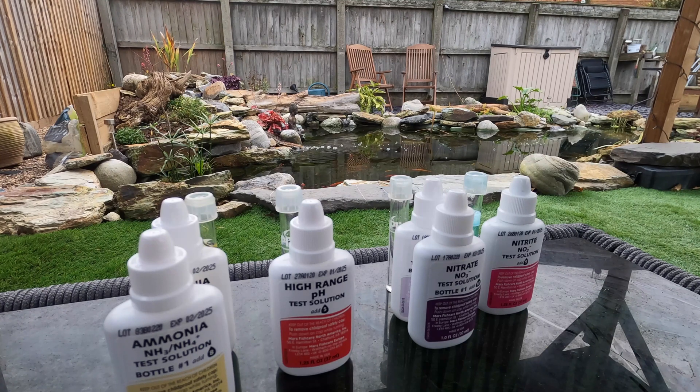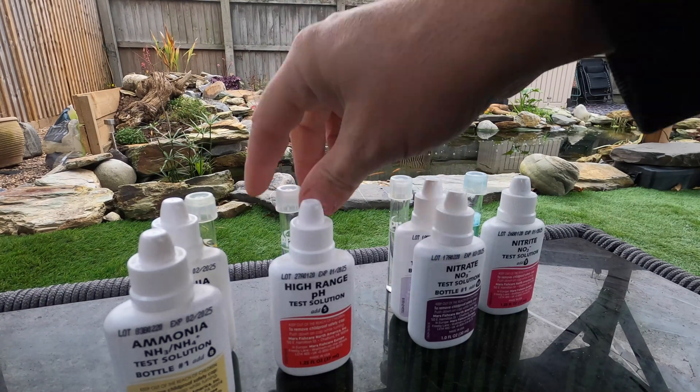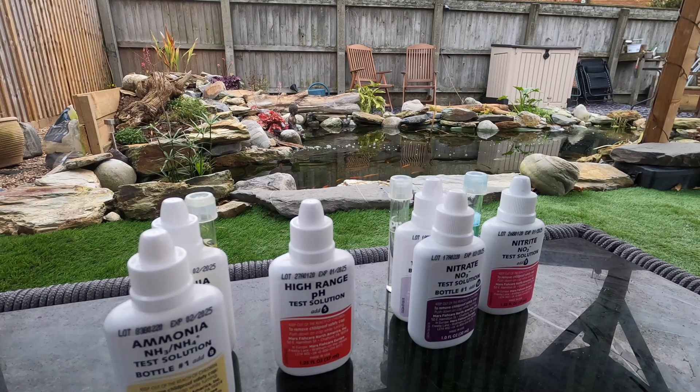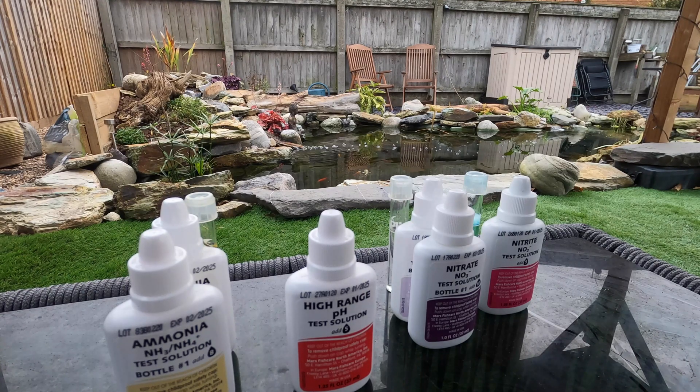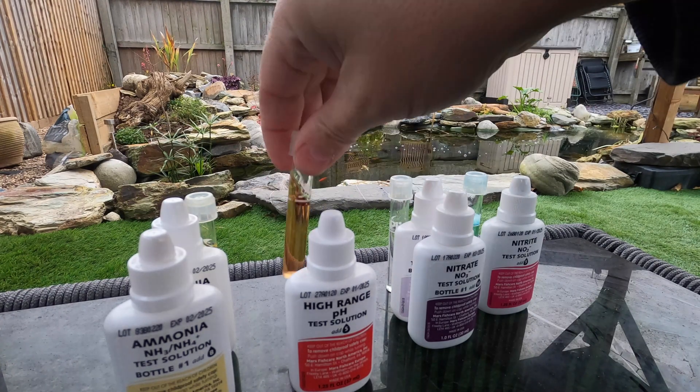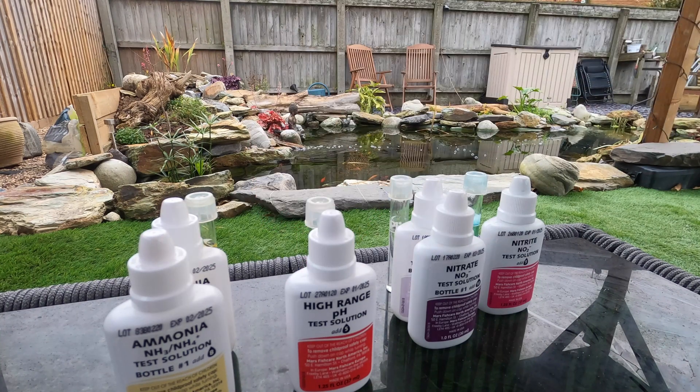While those develop, we're going to do the pH. Five drops of high range pH - this one gives an instant reading so we don't have to wait. I do the high range because I've never yet had a reading below seven and a half. Give that one a quick shake - we'll get an instant reading with that so we'll check that out in a second.